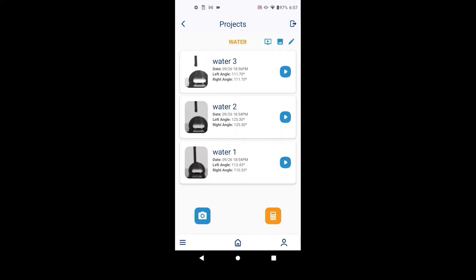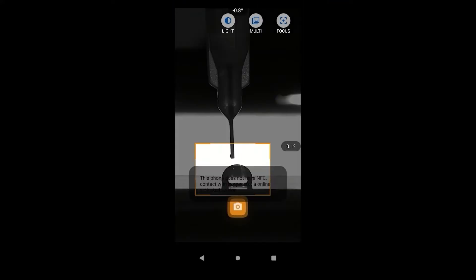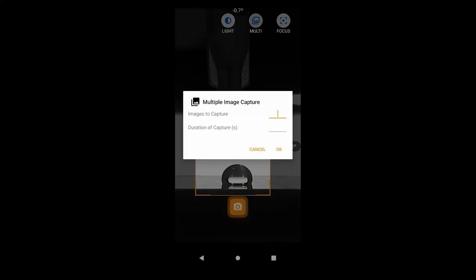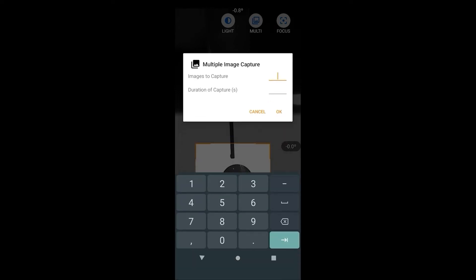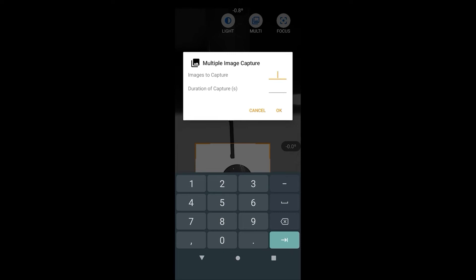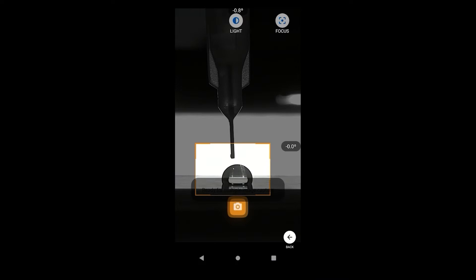Now we will demonstrate how to use multi-capture for dynamic contact angle measurement. The app's multi-capture function can be used to take multiple images in a set timeframe. The maximum frames per second without an SD card in the phone is 10 FPS. Simply specify the number of images to capture and the duration of capture, then hit the capture button and start generating the droplet.